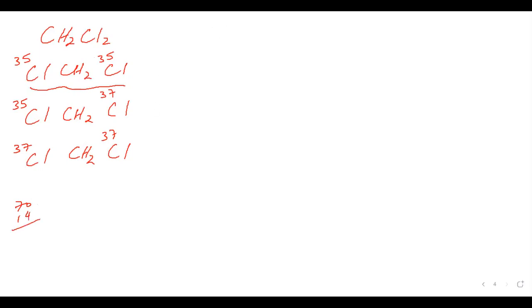We get a peak at 84, corresponding to this ion, the CH2Cl2 with both chlorines 35.